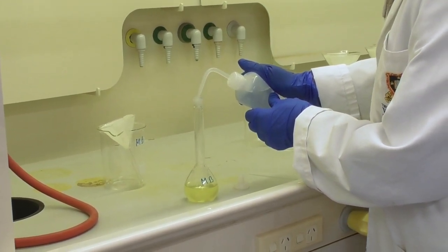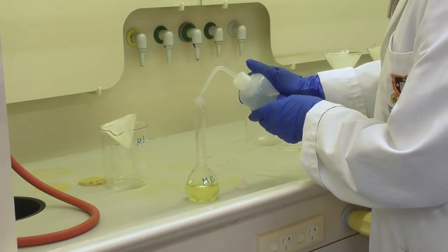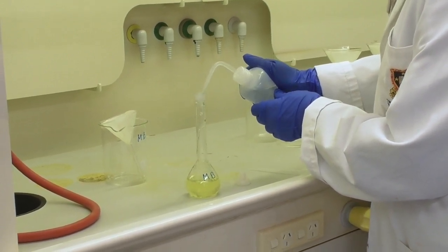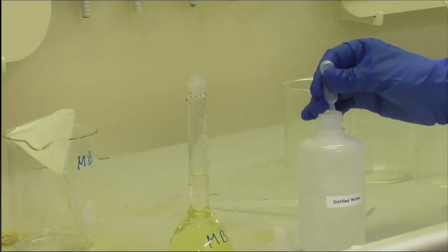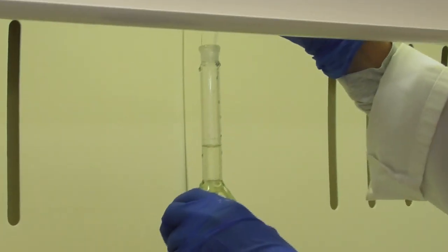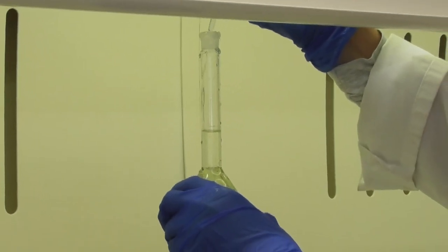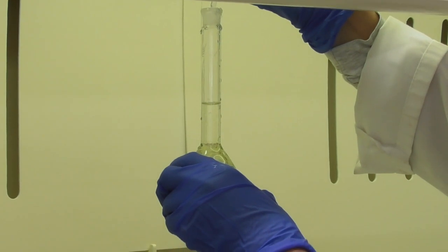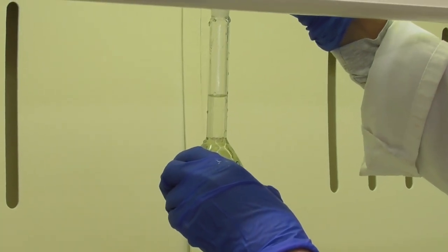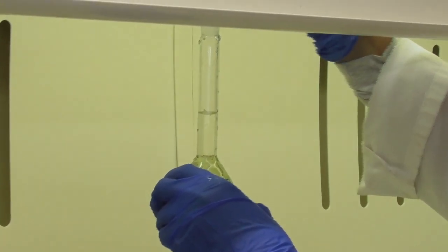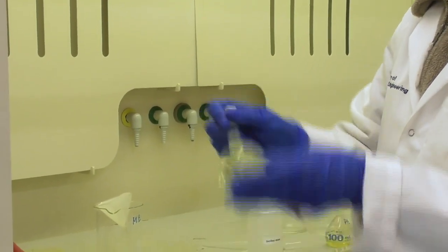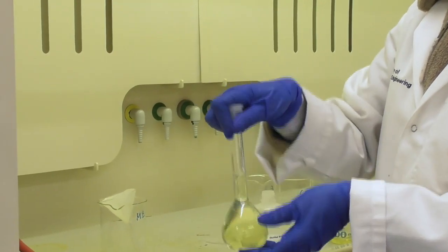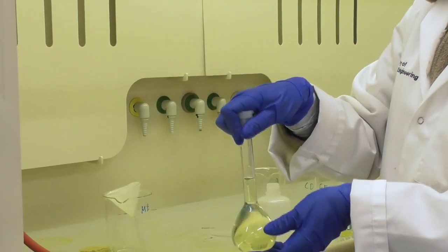I stop and add the last little bit of volume with a dropper to make sure I get the exact volume with the meniscus sitting on the line. I put a stopper on and invert the flask a number of times to make sure the contents are mixed well.